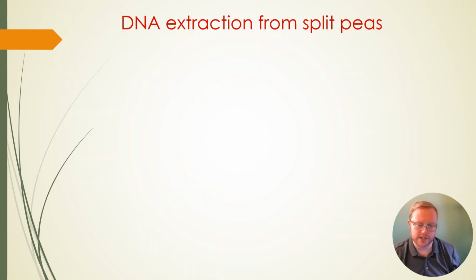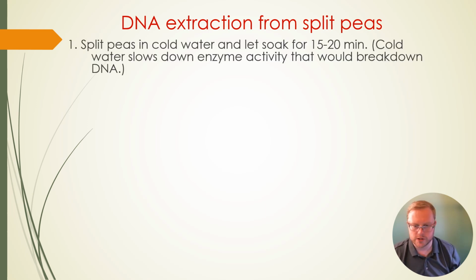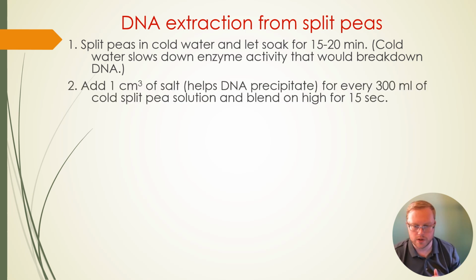All right, so today we're going to be using split peas to extract their DNA. So one of the first things you're going to do is let the split peas sit in cold water for 15 to 20 minutes. Hopefully we started doing that before the lecture.